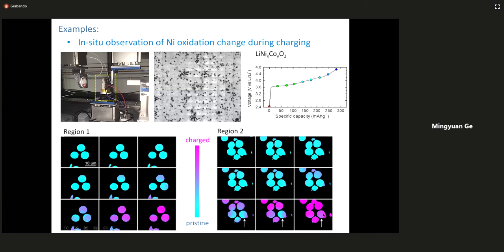So this tells us that even though the material is the same in the battery, there is still non-homogeneity in the reactions. This non-homogeneous reaction may be due to the degradation of the material itself, and may also relate to the assembling of the battery.